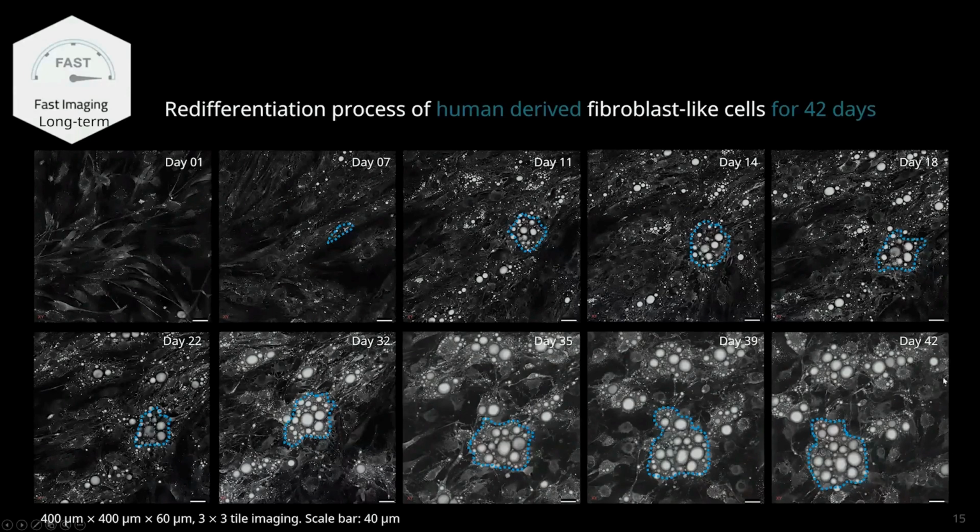We stopped the experiments due to other experiments, but if we hadn't stopped, you could just keep watching forever, as long as you can keep providing the nutrition and the other materials. You can keep watching the cell without any limitation.